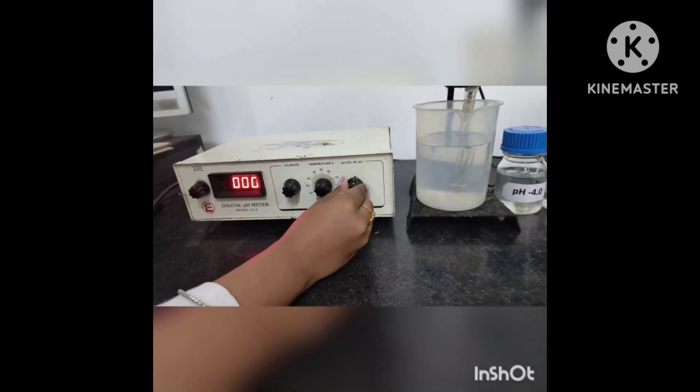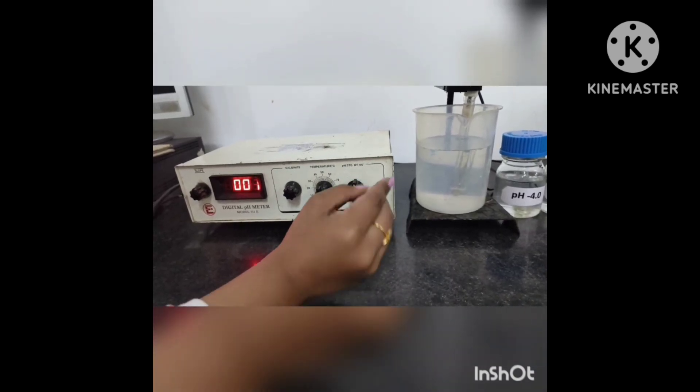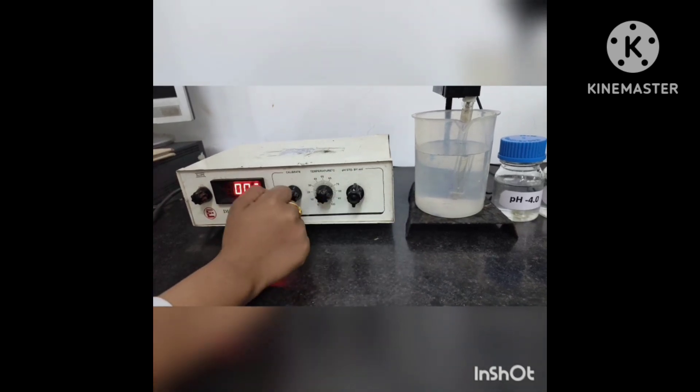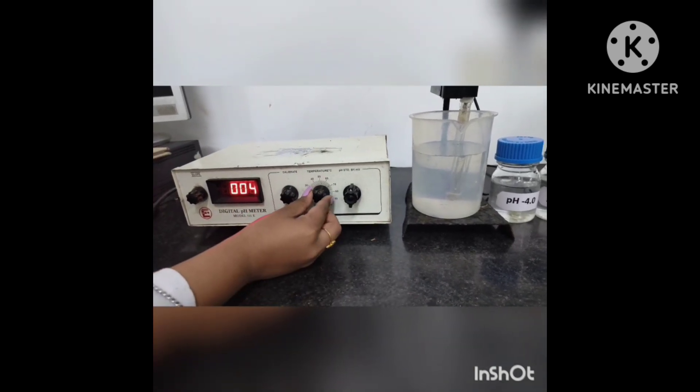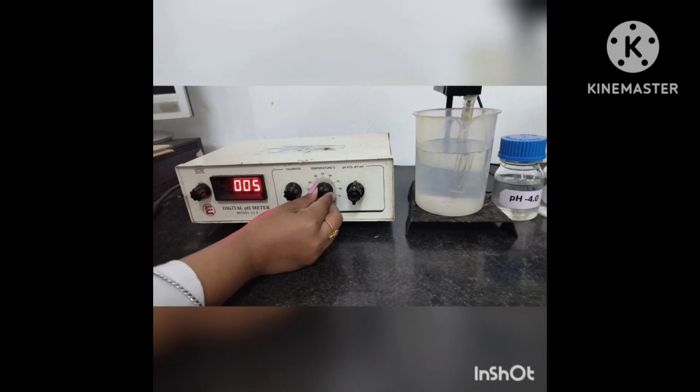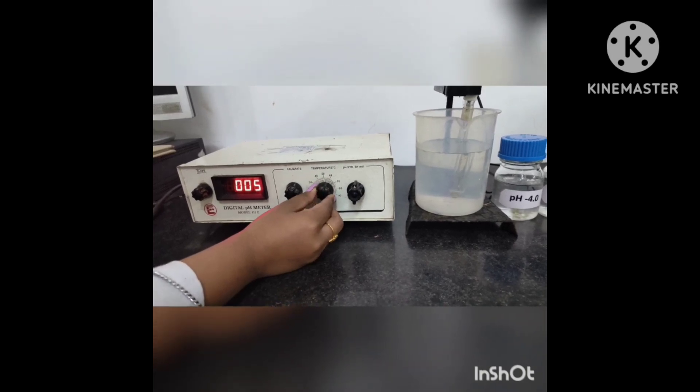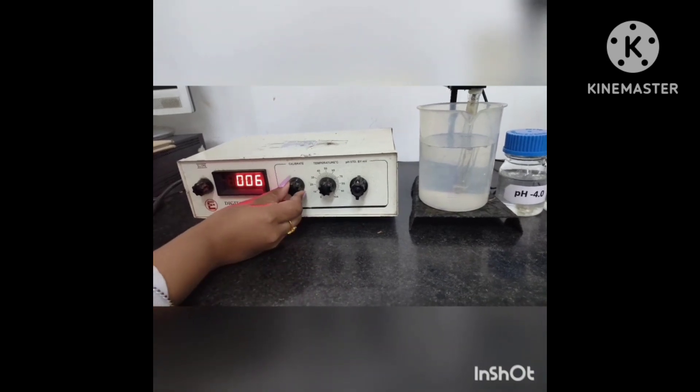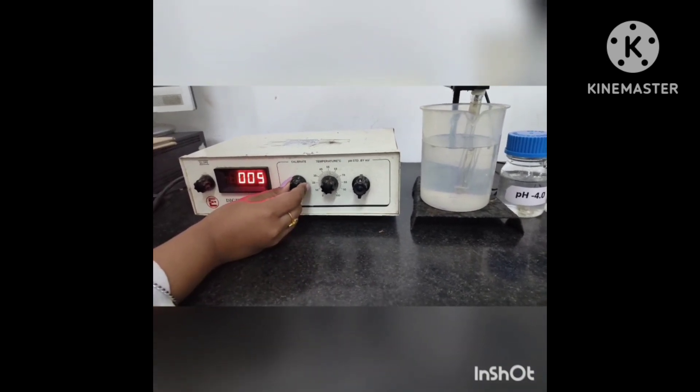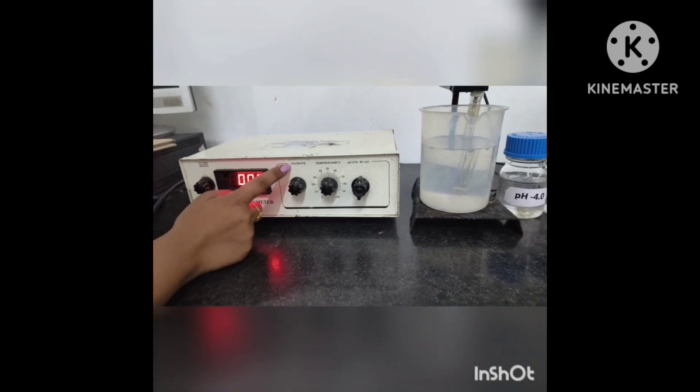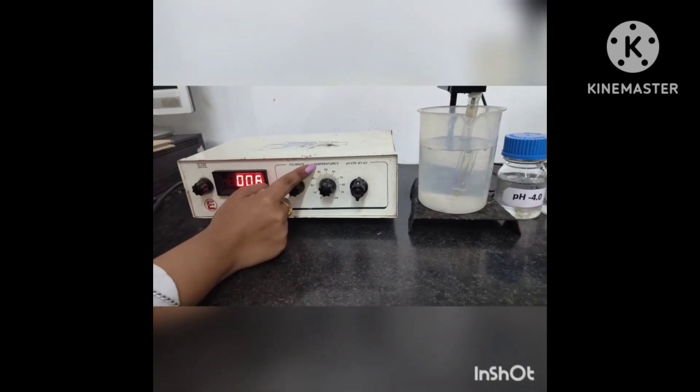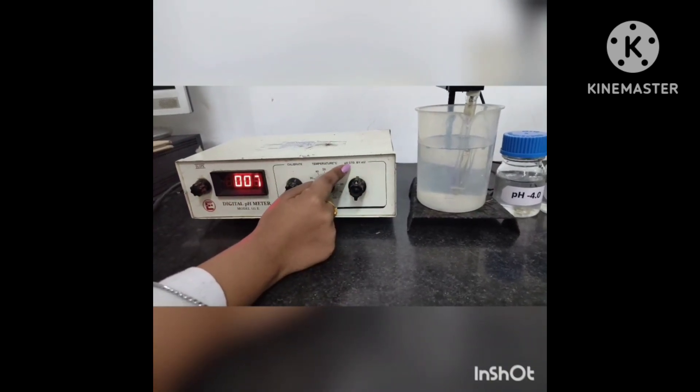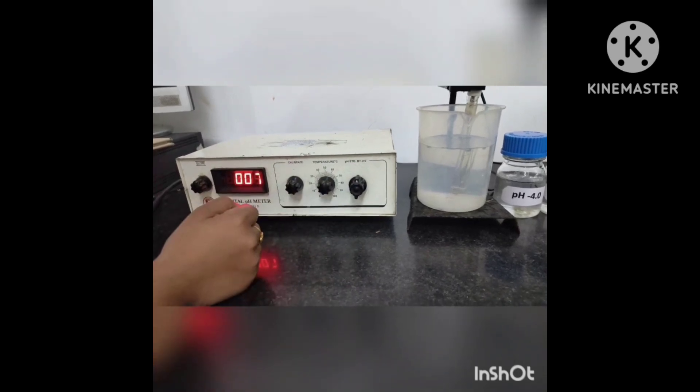The first knob is the amplifier knob, the second one is for temperature regulation, and the third knob is for calibration. All three knobs are important for the adjustment of pH and temperature as well as for the correct value of the pH. We will further know about the functions of these knobs.